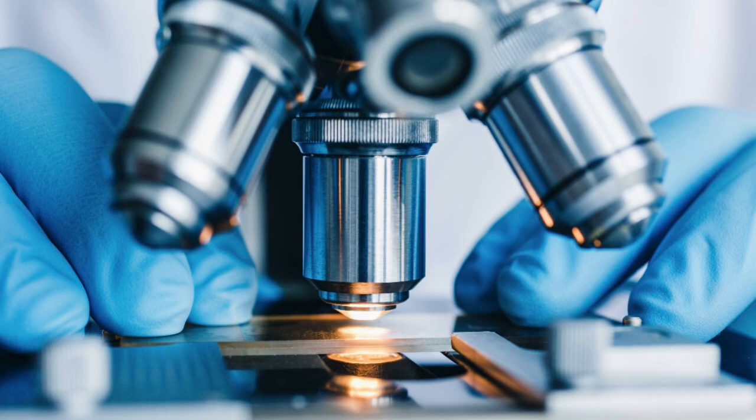In forensic science, some of the most important pieces of evidence are so small that investigators never notice them without using special tools. Yet, despite their size, these tiny details can completely change the direction of an investigation. This is where microscopes become essential.